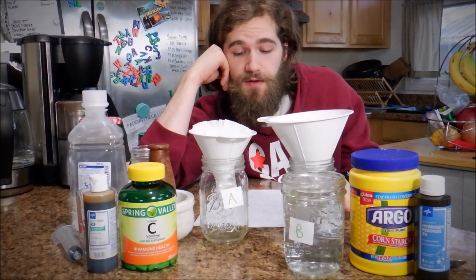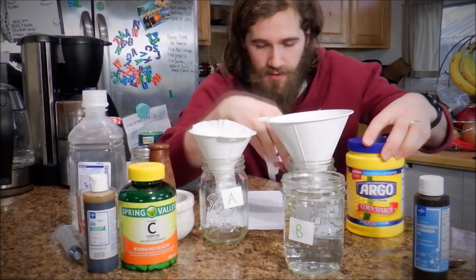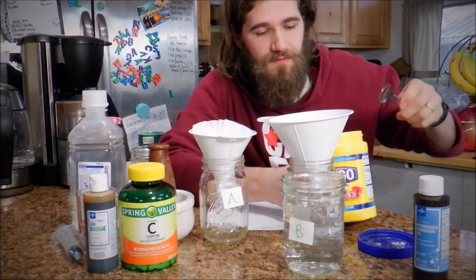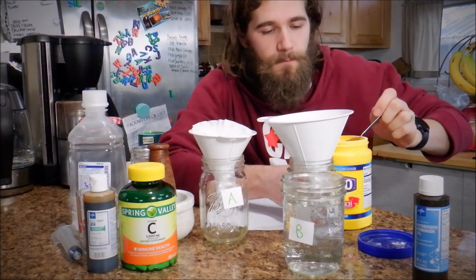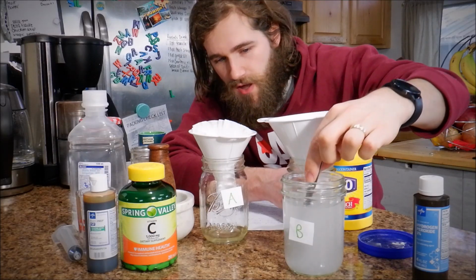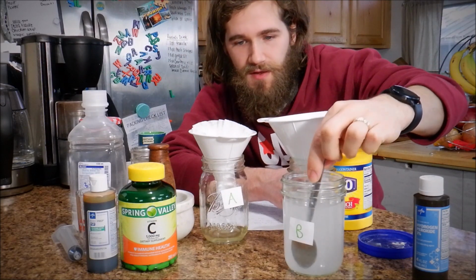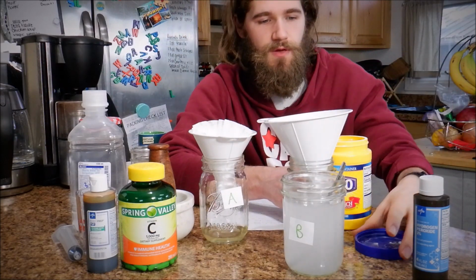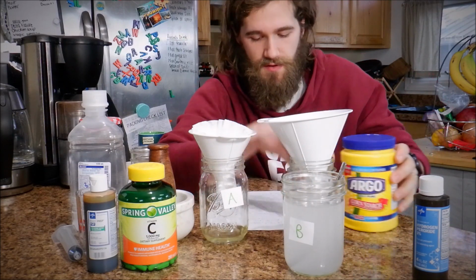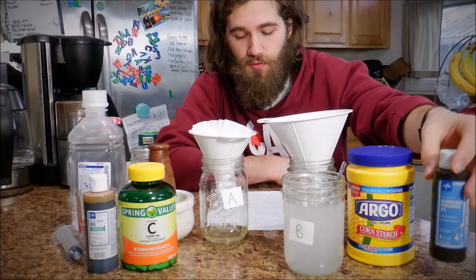For solution B, we're going to add just a little bit of cornstarch, approximately 0.4 grams of cornstarch in about 350 mLs of water. And this solution may need to be heated up, so I'll probably heat that up a little bit, stir it a little bit more, and then filter it out. And then once that's filtered out, solution B will also get approximately 150 mLs of 3% hydrogen peroxide.